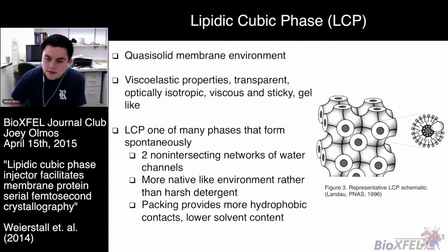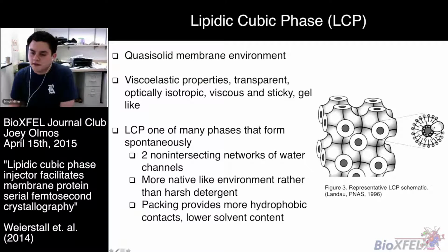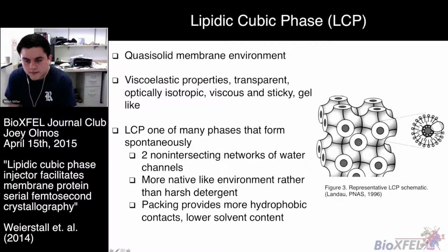On the right, let's see if I can use my cursor, you see this egg-shaped thing going on, and that's seeding going on in the lipidic cubic phase as a schematic. And one of the cool things about this too is that because there are these networks of water channels, you can also get feeding of more protein to nucleation sites with the lipidic cubic phase.